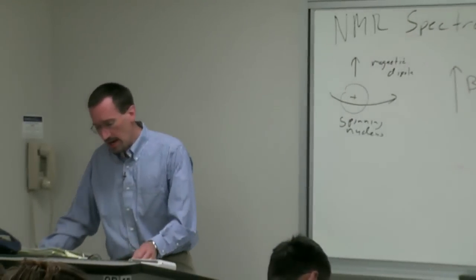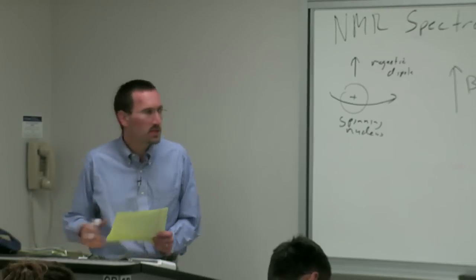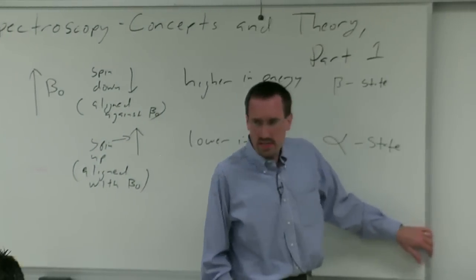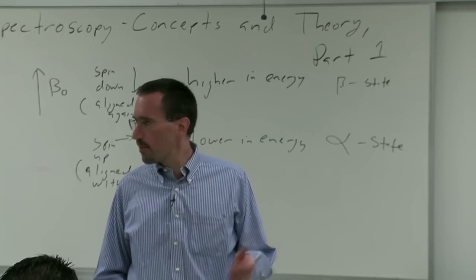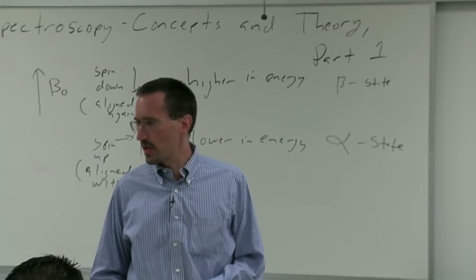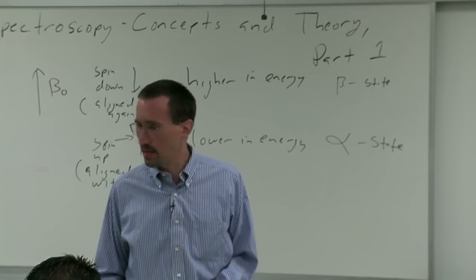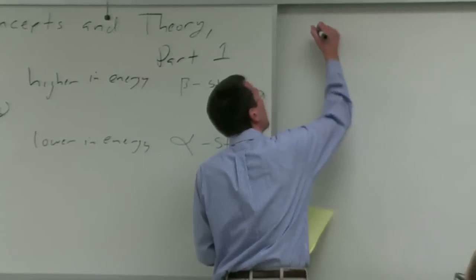Now, different types of nuclei have different spin properties. Rather than trying to start with generalizations about rules, I'll come to those in a moment because at some point you'll be wondering in your project, well, could I study chlorine 35 or something like that? Let's just start with typical nuclei studied.